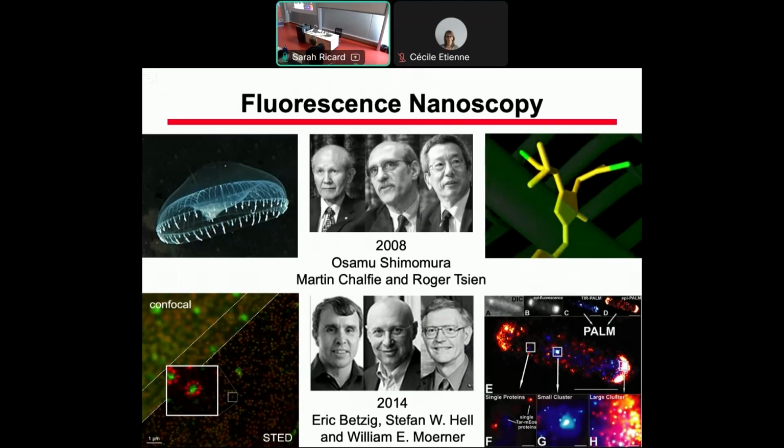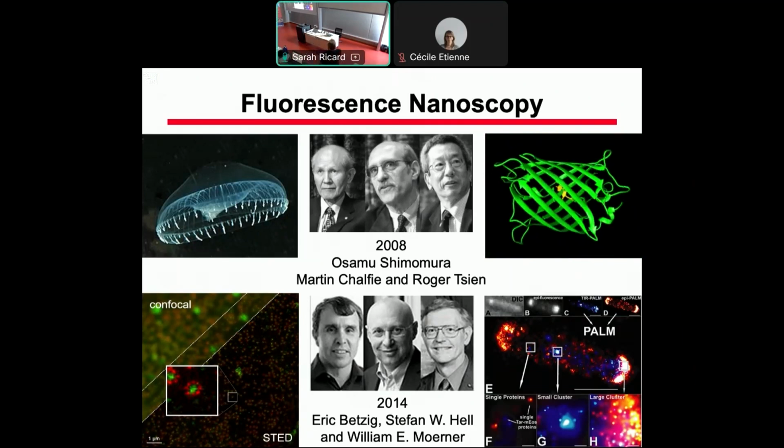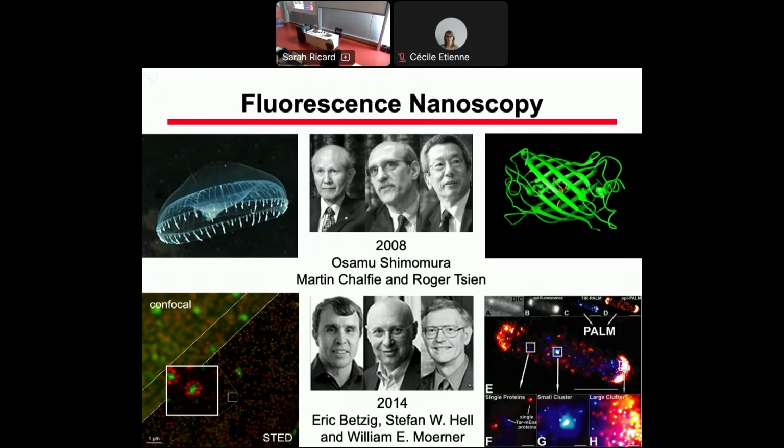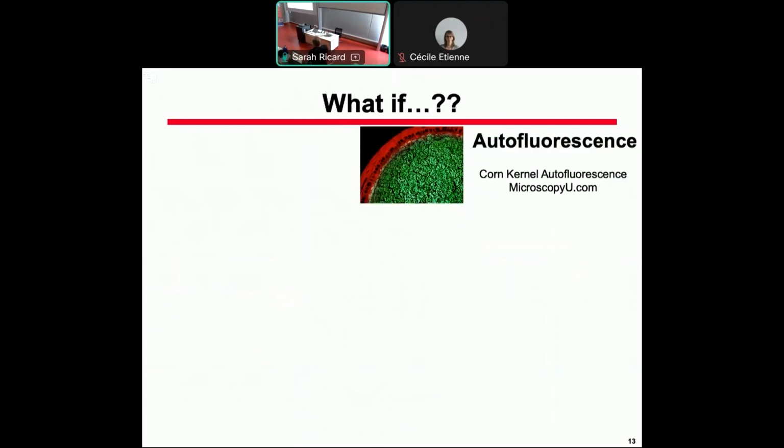And now we have STED and many variants of this super resolution, except that it utilizes fluorescence. That is a little bit sometimes the drawback.